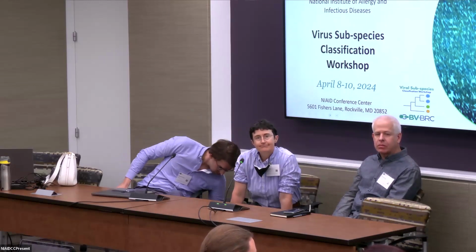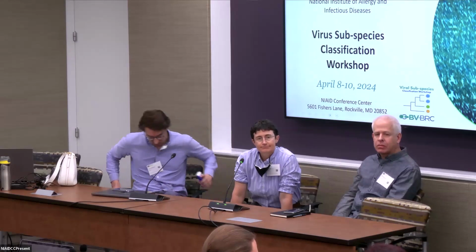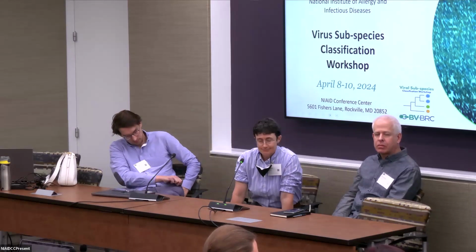So just related to that, often when you see amplicon dropout, there are some amplicons that drop out more than others, and there are sites that you will be very familiar with that can get flagged. Is that something that happens in Ripples? Could you filter the output by something that would be more or less likely to be due to sequencing error? Good question. I wish Yatish were here.